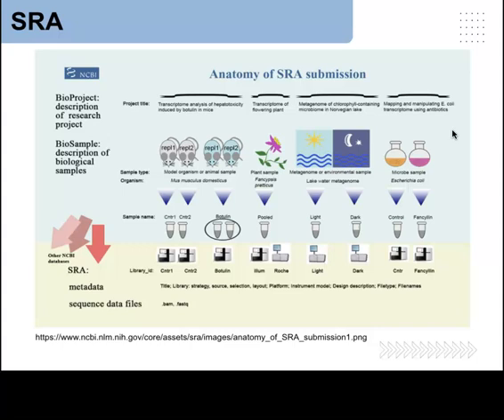And each one of these sequencing libraries has a different type of biological sample, may or may not have biological replicates, may be part of a treatment group, for example, treated versus non-treated, can have a different type of sequencing strategy, for example, ChIP-seq versus RNA-seq, may have been sequenced on a different type of instrument, and the reads themselves may be paired-end or single-end, that is unidirectional sequencing.